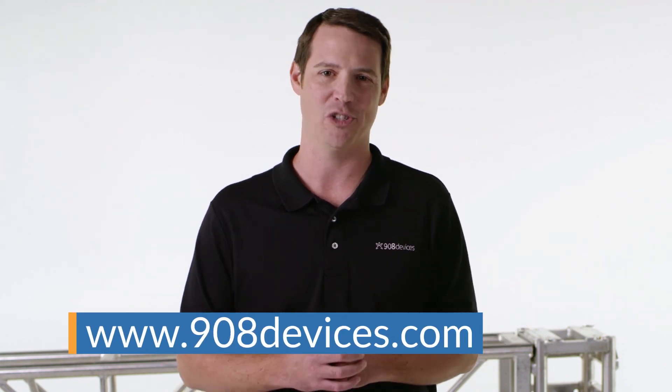This was a quick introduction to MX908, our latest handheld mass spectrometer. Remember, MX908 is the only handheld trace detector driven by the power of mass spec, designed and purpose-built for responders in the field. For additional information, check out our website or contact us directly.